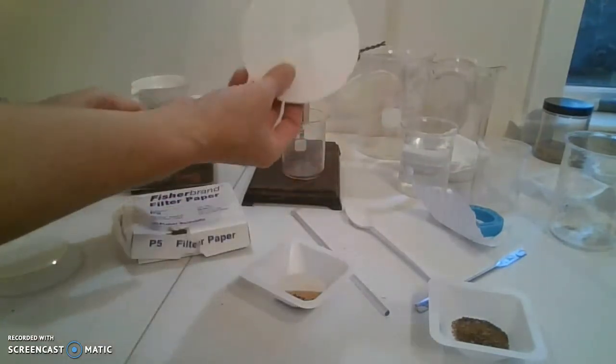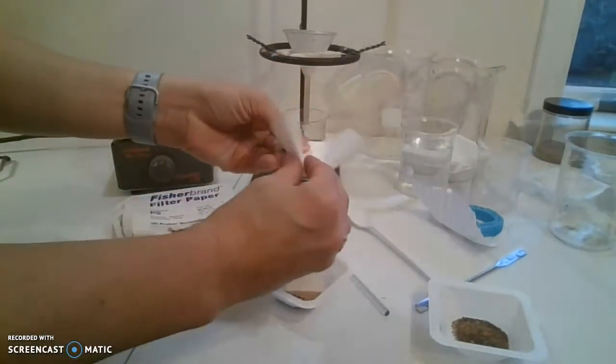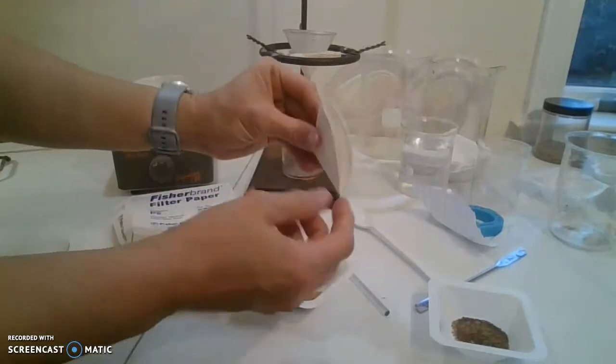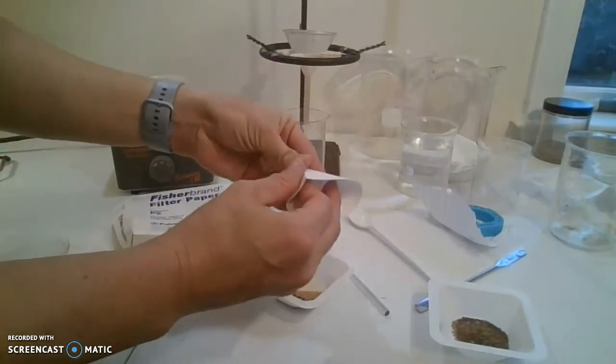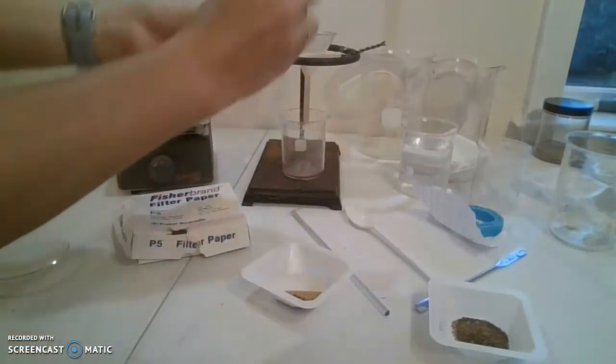the funnel. I'm going to take some filter paper and fold it in half twice so I get a little quarter, and then you separate it into three and one side so it makes a paper cup that goes directly in your funnel.